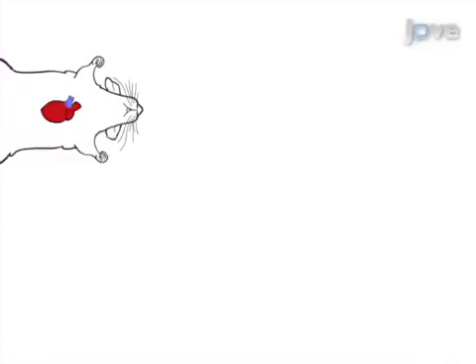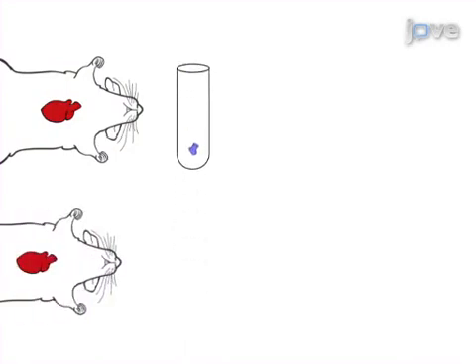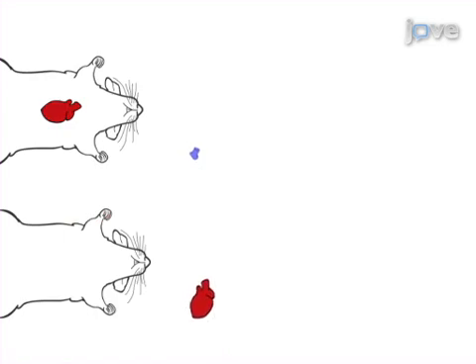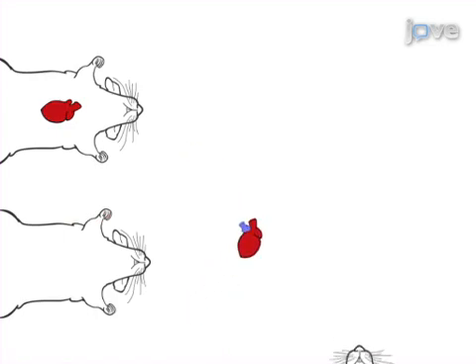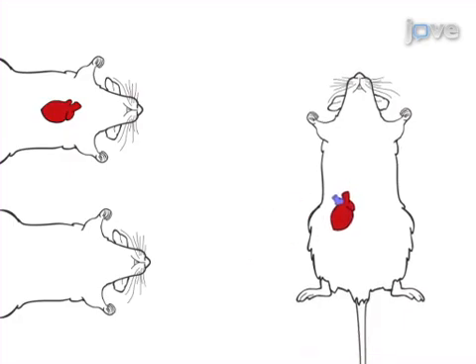This is accomplished by first harvesting the pulmonary heart valve from donor mouse heart tissue. In the second step, the entire heart is harvested from a second donor. The donor pulmonary heart valve is then implanted onto the donor heart, and the heart with the new heart valve is heterotopically transplanted into a recipient mouse.